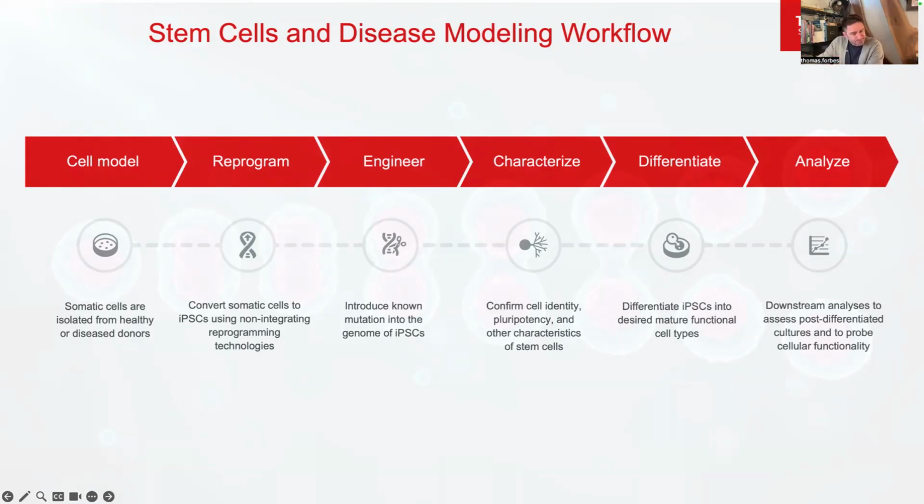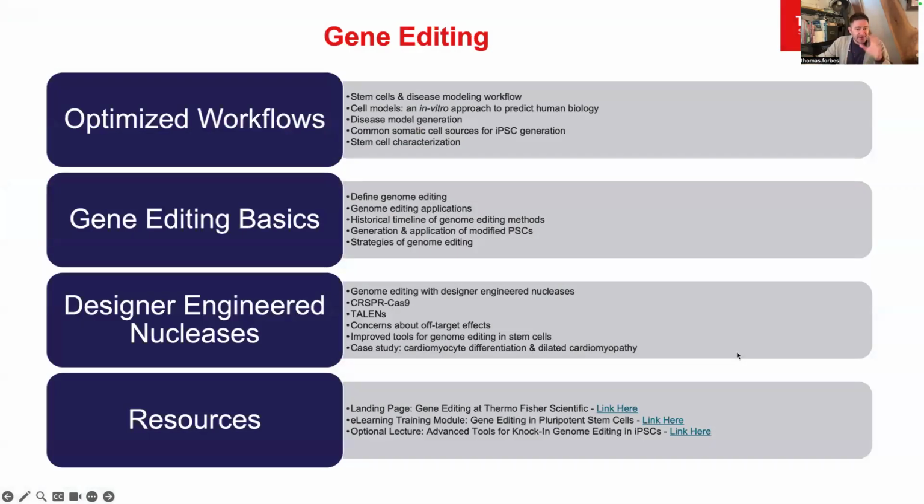StemFlex medium. And then we showed that these iPSC and CRISPR-Cas9 systems were quite a good tool for influencing different mutations, and in that the functionality then of cells, right? In this case, especially cardiac cells in the context of dilated cardiomyopathy. Again, I put this slide here just as a quick overview as to what we talked about today.